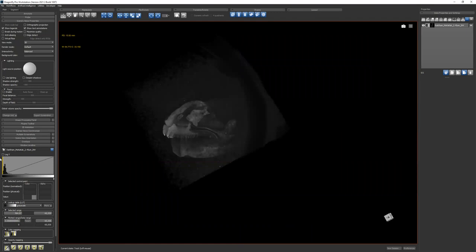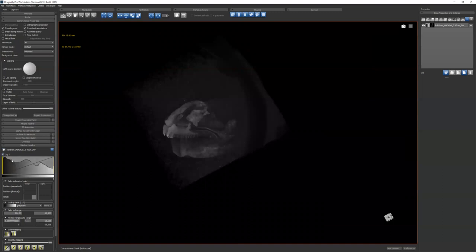Over here, you have a histogram that shows you your gray values distributed. You want to see the log of that, otherwise it's kind of hard to see. And it should be kind of a nice curve like this. If you have reconstructed data that looks large here on the y-axis on the left and then shoots downward, then you need to reconstruct your data because you are missing a lot of it.